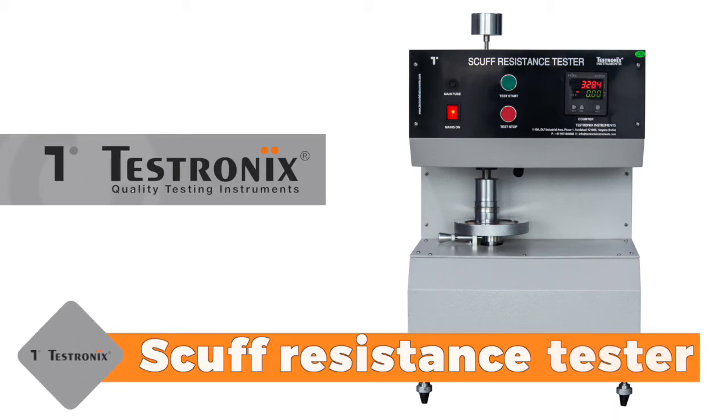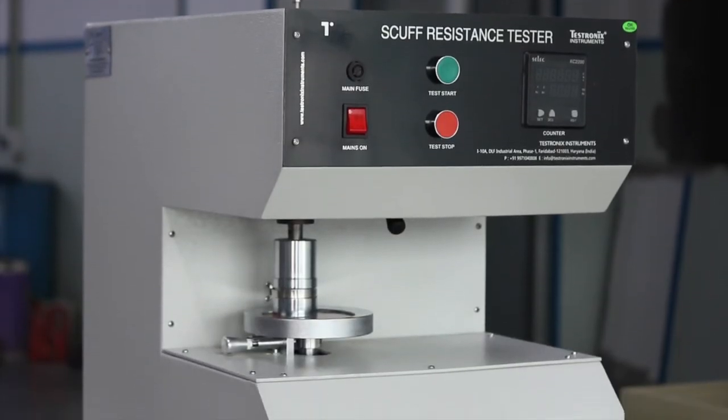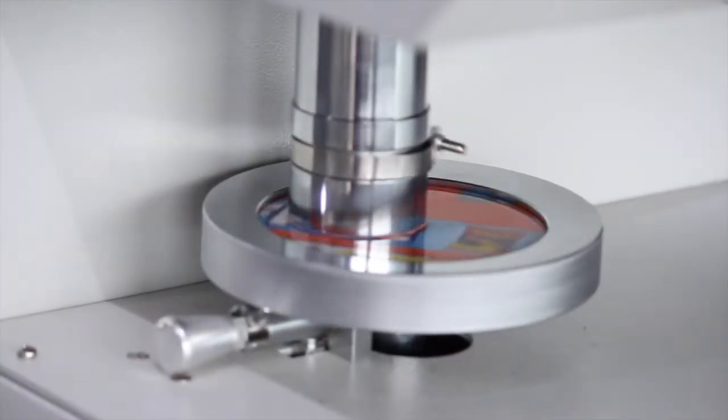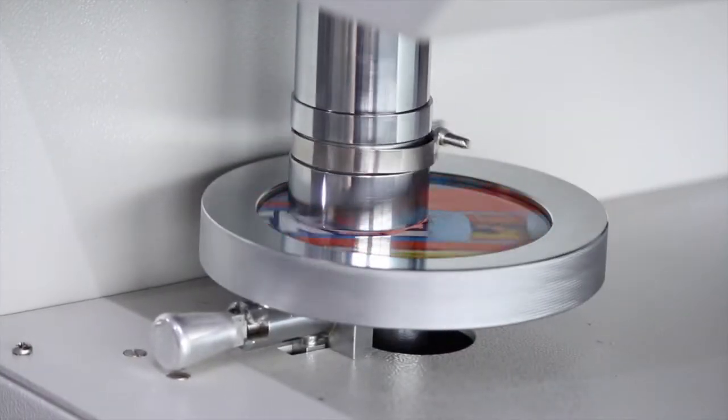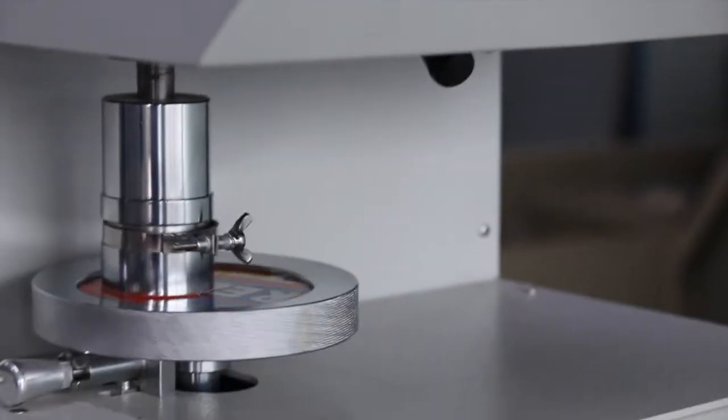The Scuff Resistance Tester TX SRT 100 is the most accurate scuff resistance tester manufactured by Testronix. It is a highly precise instrument to evaluate the rub resistance between two stickers or any other flexible printed material.